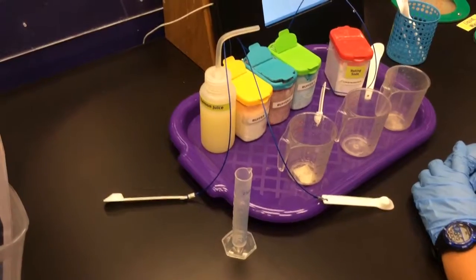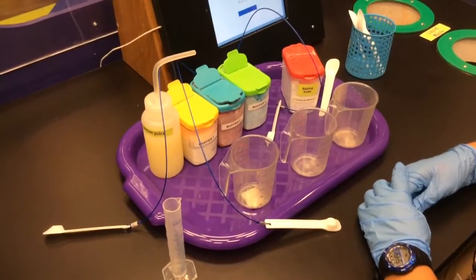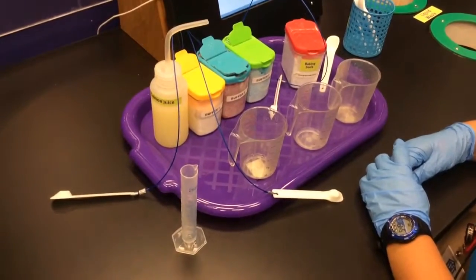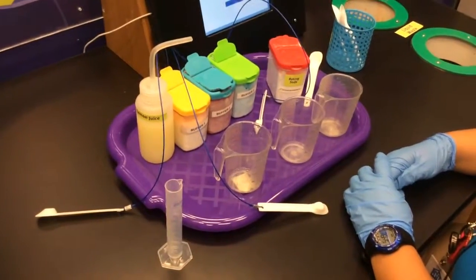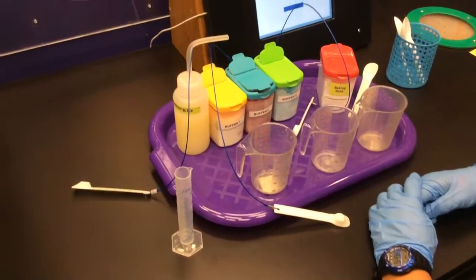And then the other thing is the actual reaction time. We want to see how fast bubbles are able to form. If they're able to form very, very fast, then we know that maybe this is not a great buffer. All right, so we're going to try out these three.